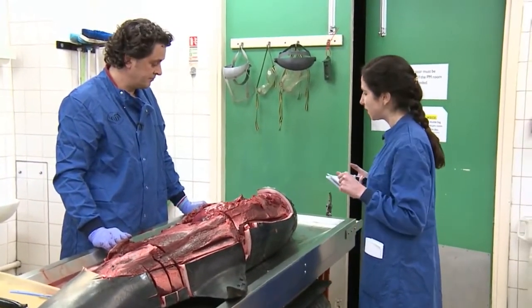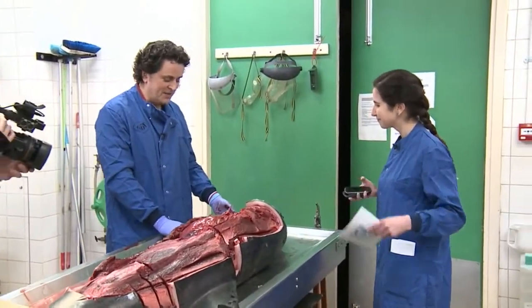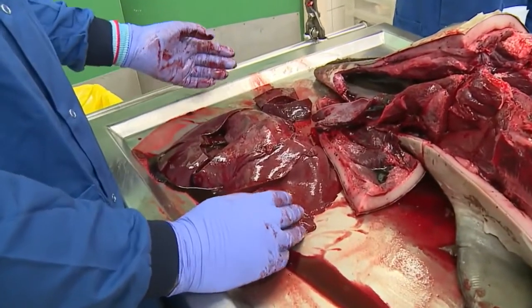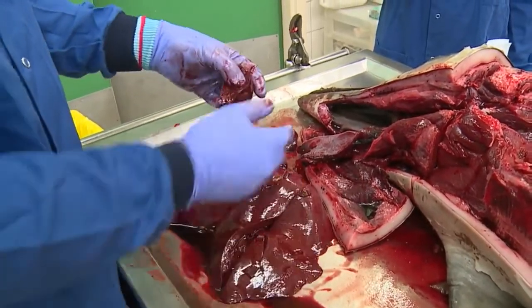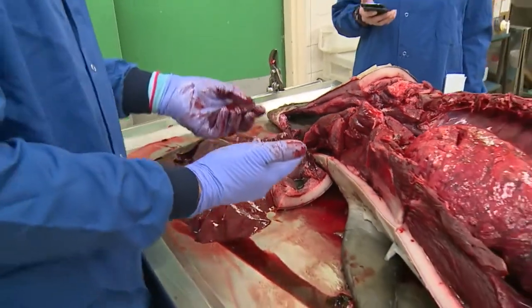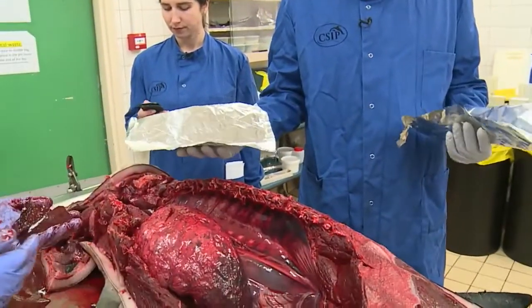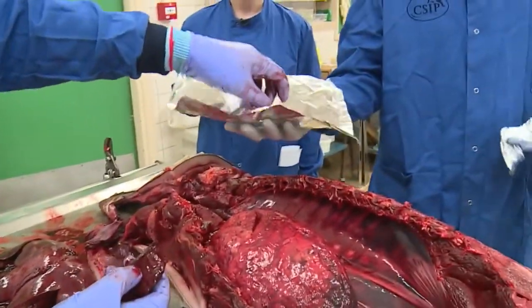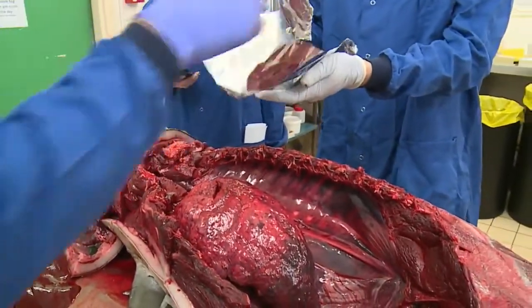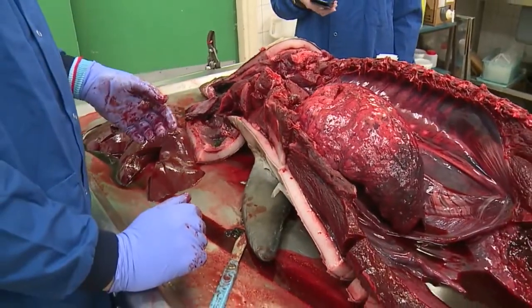You've removed some of the organs now. Is there anything in particular you'd like to show us? Yeah, so this is the liver, what's left of the liver now. In the break we went through it, so it's a large bilobed, two-lobed organ. And we've taken out some samples, which Matt will collect as well. So in the same way that we're looking at the blubber for the man-made compounds, we'll analyse the liver for the naturally occurring compounds, things like mercury, selenium, zinc, cadmium, lead. We'll look for those naturally occurring compounds. We'll assess those as well, potentially.